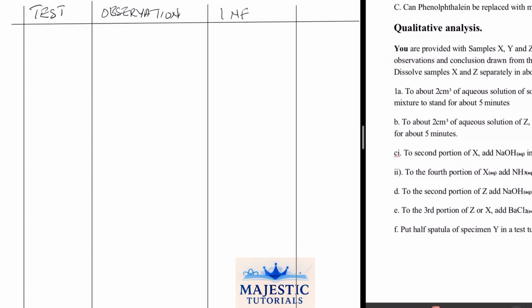What will happen here is very simple. X aqueous plus Y solid plus 5 minutes, depending on what is our observation.